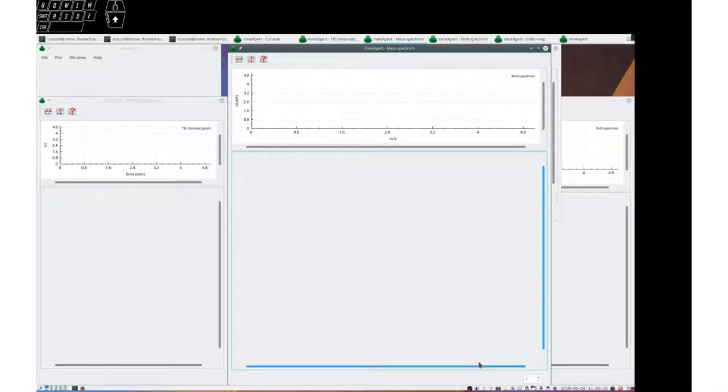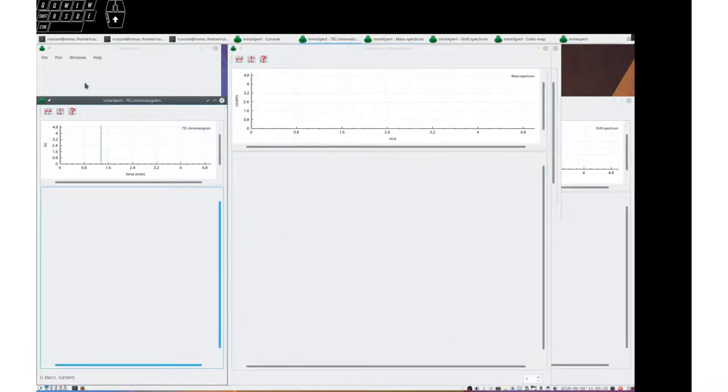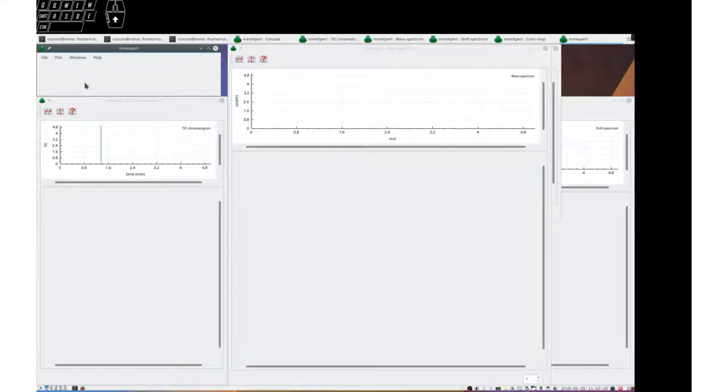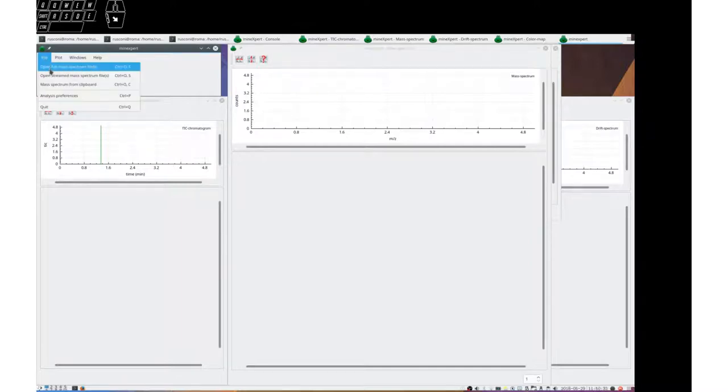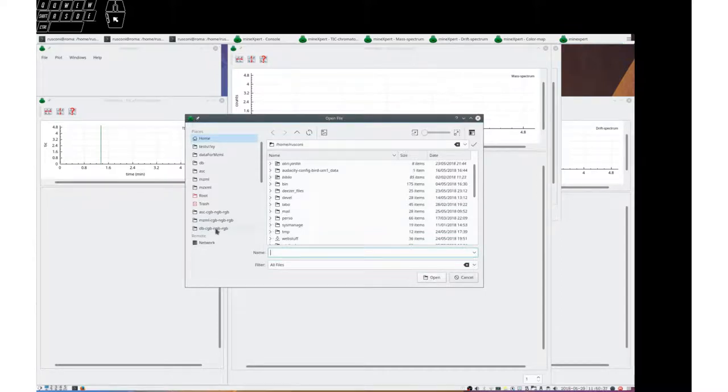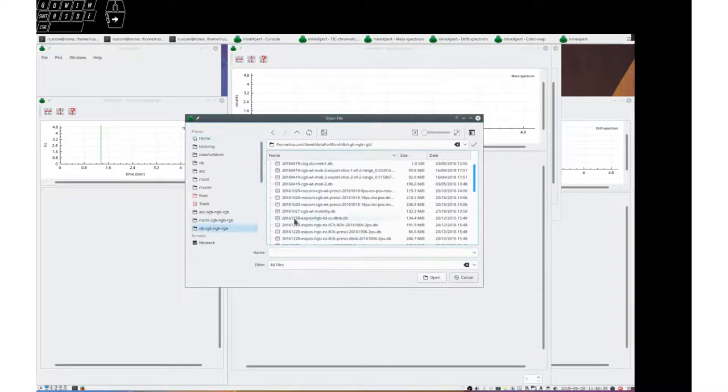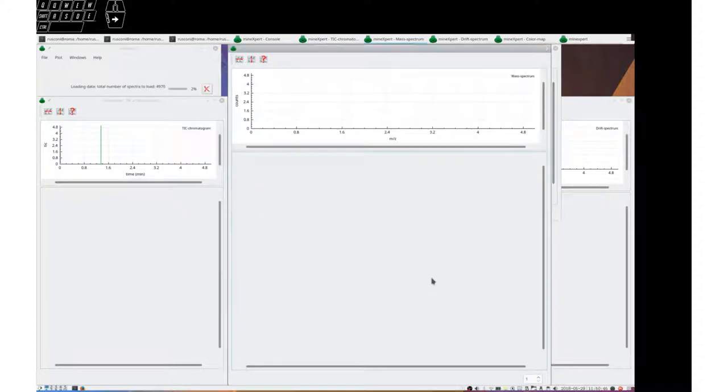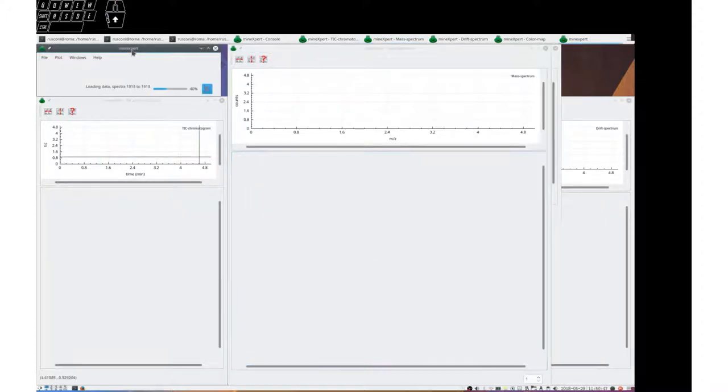MZ integration means that the data loaded from file are integrated into a mass spectrum. Let's open a drift time mass spectrum, also known as ion mobility mass spectrometry data file.